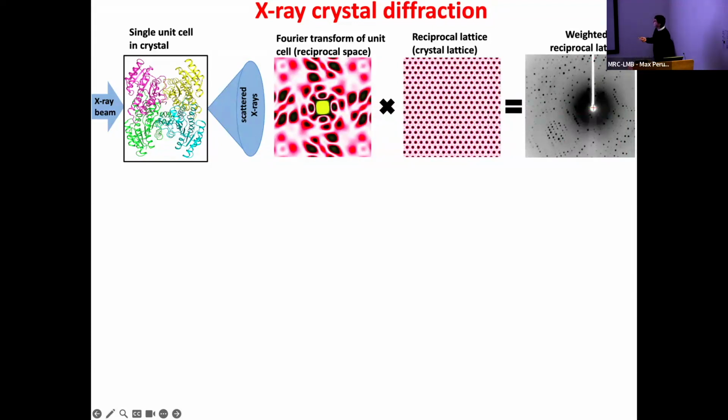So that's how they used to teach me crystallography in my university lecture. I don't know if this means anything to you. It didn't used to mean anything to me, so I went to dig a bit deeper. I'm going to try to show you how understanding these things works. Each spot you see here is called a structure factor. Each of them will have an amplitude, a phase, and 3 numbers. And these numbers are not random. We're going to look now at why we get an amplitude, a phase, and these 3 numbers.